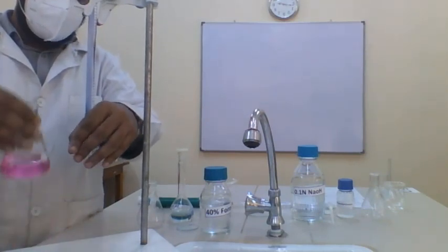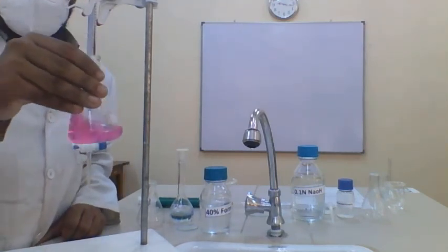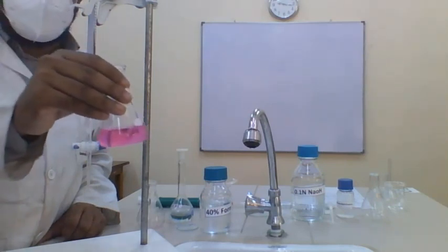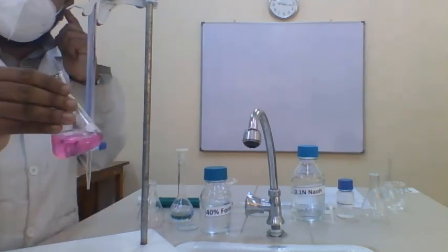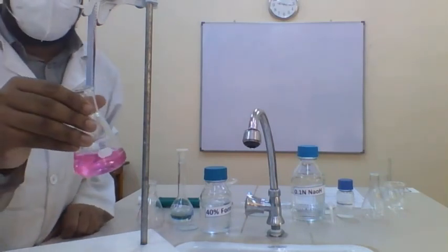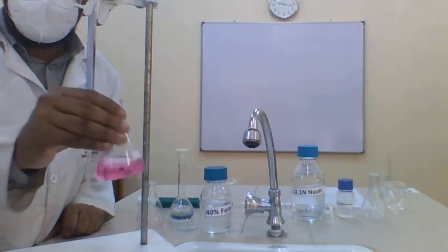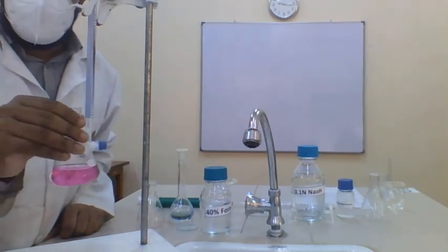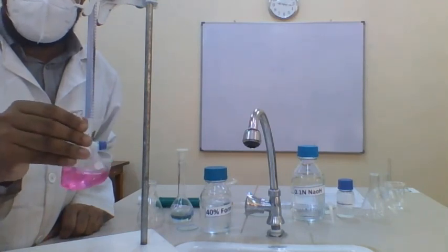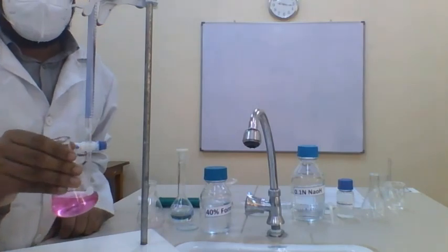You can see when I add more sodium hydroxide, the pink color will get concentrated, but this has exceeded the endpoint. One might think that I haven't added an indicator at the carboxylic region, but in the previous step, I have already added phenolphthalein. Therefore, at the end titration, no need to add the indicator again.